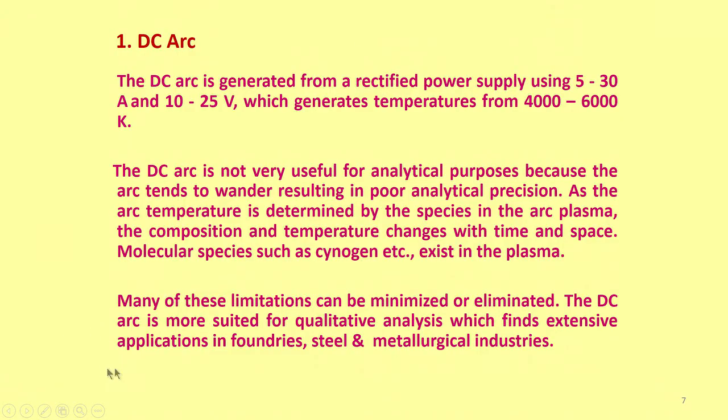So, bring them together and strike and record the spectrum straight away, and all the elements that are there will produce line spectra, and you identify the lines and say this element is there or not, pass or fail. So, for qualitative quality control, that is fine, but not for quantitative analysis.